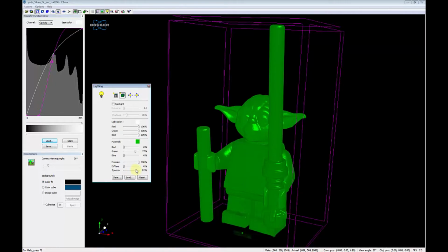And so just like diffuse lighting, most of the time we're going to keep these values pretty small to medium. However, if you have something that's really reflective naturally, or really metallic, or has a wet kind of texture in its native state, sometimes it's helpful to go ahead and use large values here in order to give that texture that you're looking for.